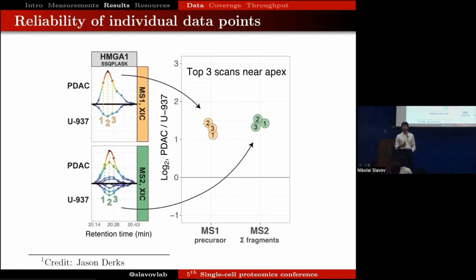And this is reliability at the level of a single peptide measured in single cells. It's something that I find very gratifying. This is an exemplary case. The data will not always look like that. Sometimes there might be disagreement, and that is really good to know. If our data are noisy, we better know that they're noisy, but if they're not, you can have this confidence. So in terms of quantification, there is certainly the capability to achieve a very high level of quantitative accuracy, associated with estimates of what this accuracy is.